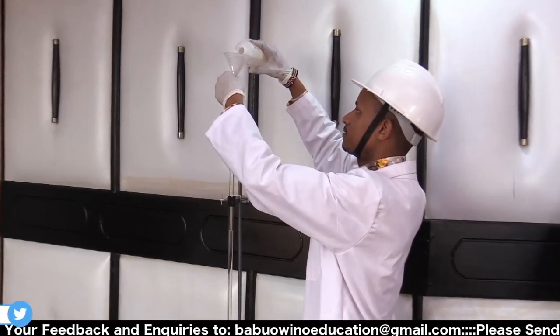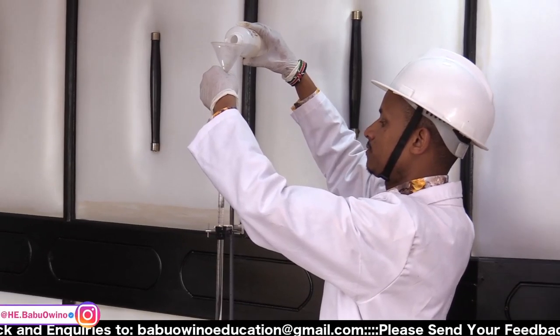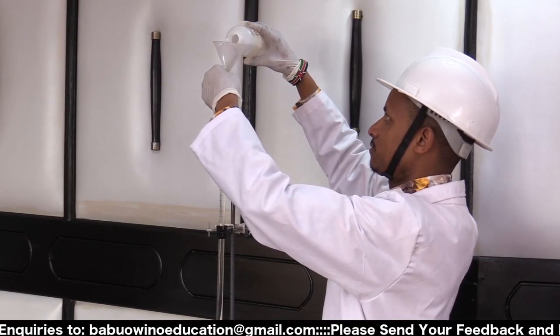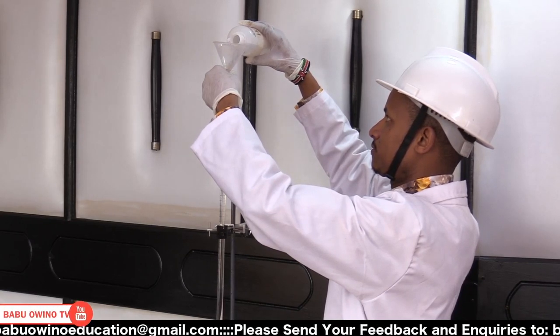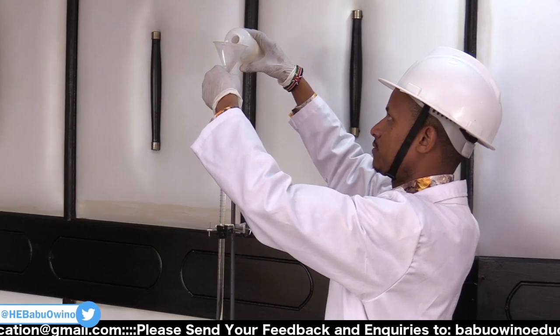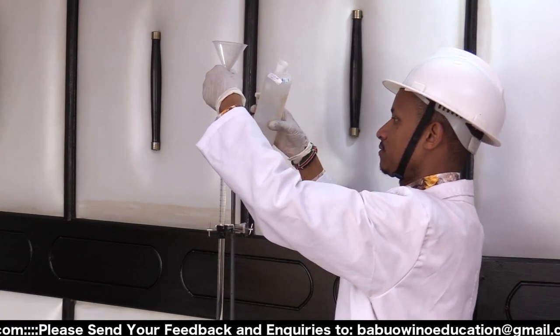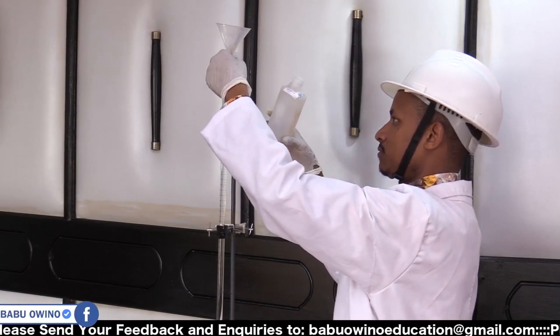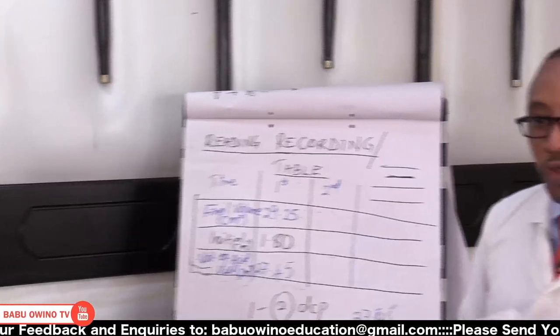So that we are consistent. This is what we are calling titrant reacting with the analyte. From the burette, titrant. From the pipette, analyte. And therefore, what we get here is a titer. Once we repeat that, we get another second titer. So this process is also called titration.